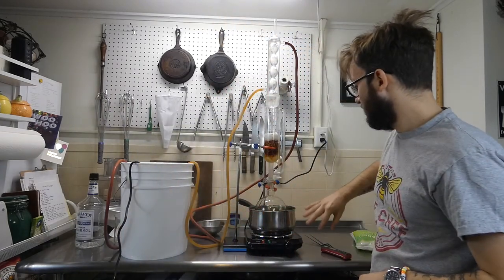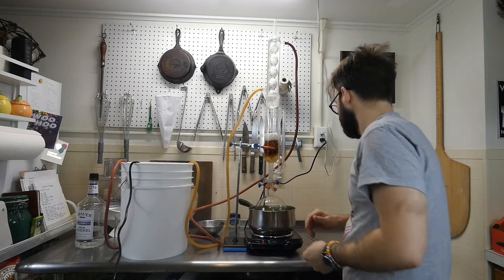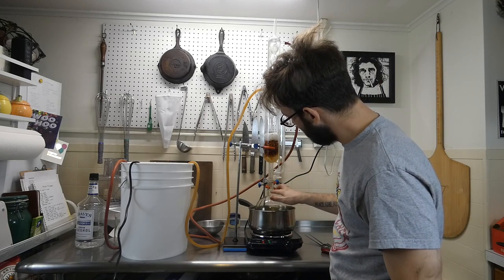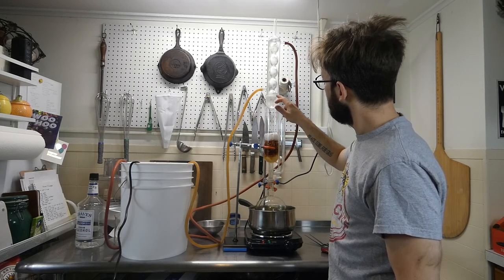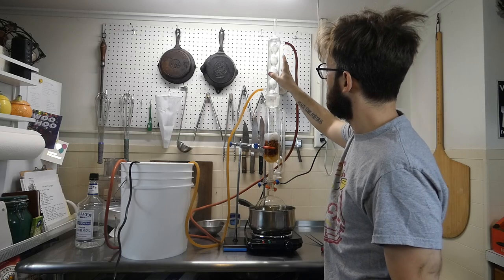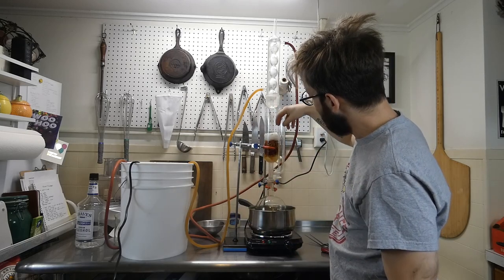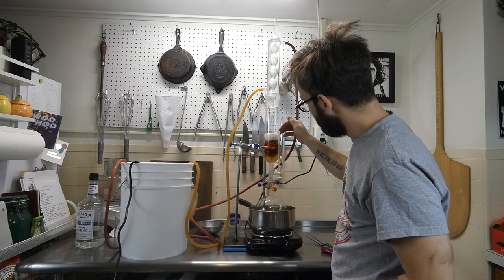All right, so I just want to explain a little bit about what exactly is going to happen as this does its thing. The first thing that is going to happen is we're going to see the ethanol begin to boil. As it boils, the vapors from the ethanol are going to climb up this side tube here, head up here, and start making its way up into this condenser. Once it hits this condenser, because this water is super cold, the vapor is going to start condensing, which then is going to fall back down into ethanol, liquid form, and it's going to start making the extraction.